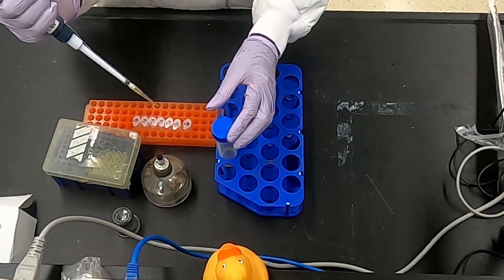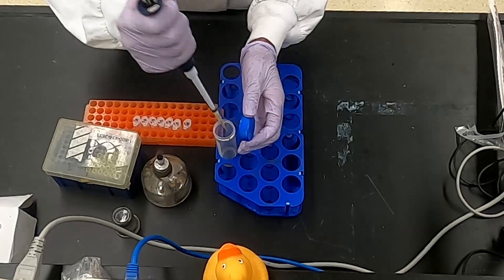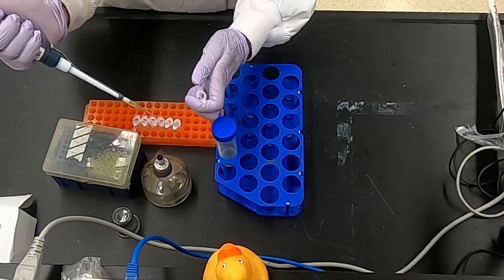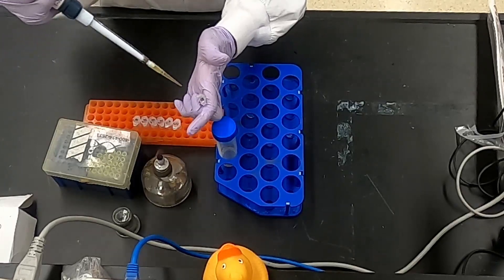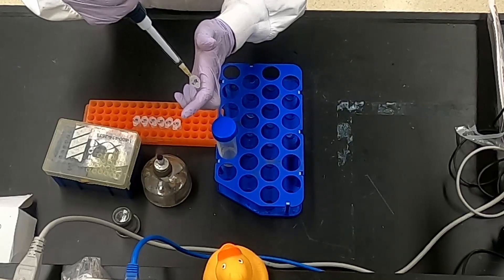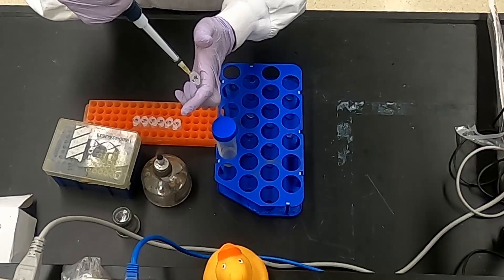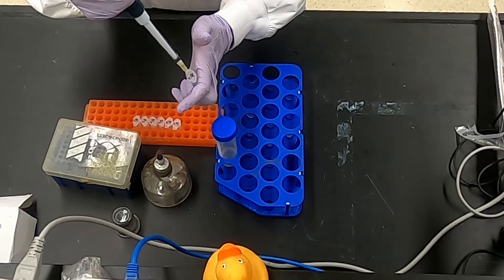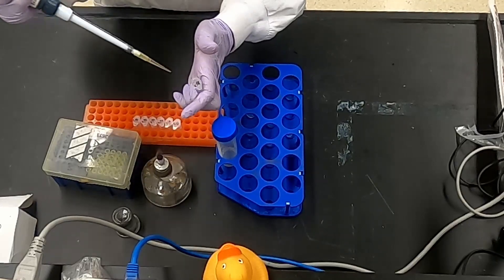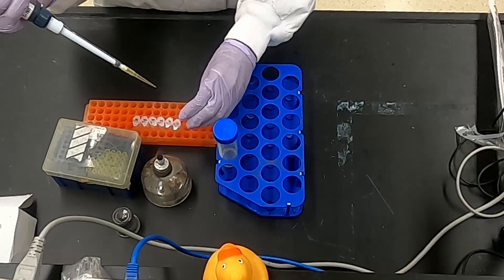For example, a 1 in 10 serial dilution occurs when one volume of your food sample is added to 9 volumes of the diluent. The first dilution is mixed and the process is repeated to continually dilute the previous dilution. As a result, multiple dilutions are created and the concentration of the food sample in the diluent becomes less and less with each new dilution. The most concentrated dilution is termed the 10 to the negative 1 dilution, and the second most is the 10 to the negative 2 dilution, and so on and so forth.